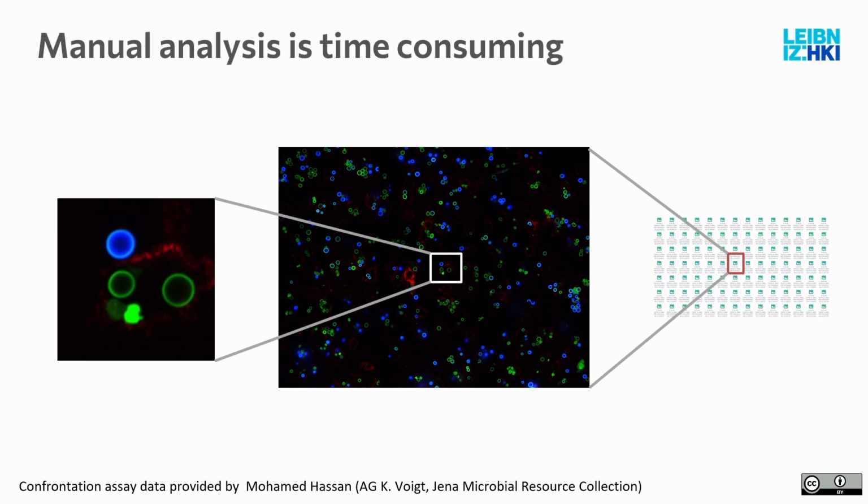Mohammed, who did this originally, took like 8 months or so, counting it manually. So if you want to do this, then you can do this, but not me. And I hope you also don't. That's why you're here. You're learning image analysis, and the computer does it for us.